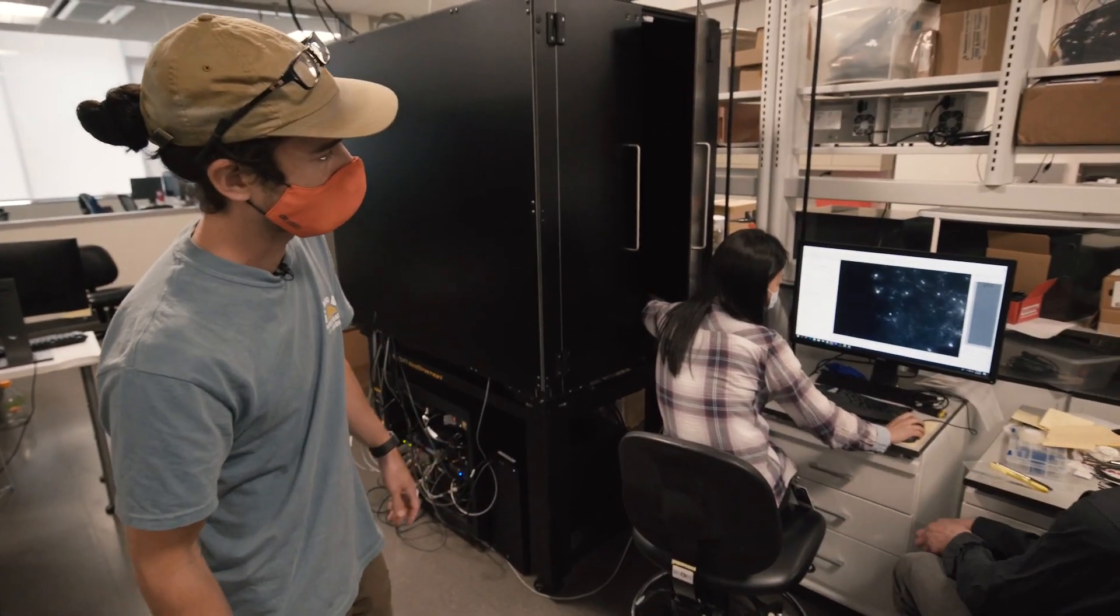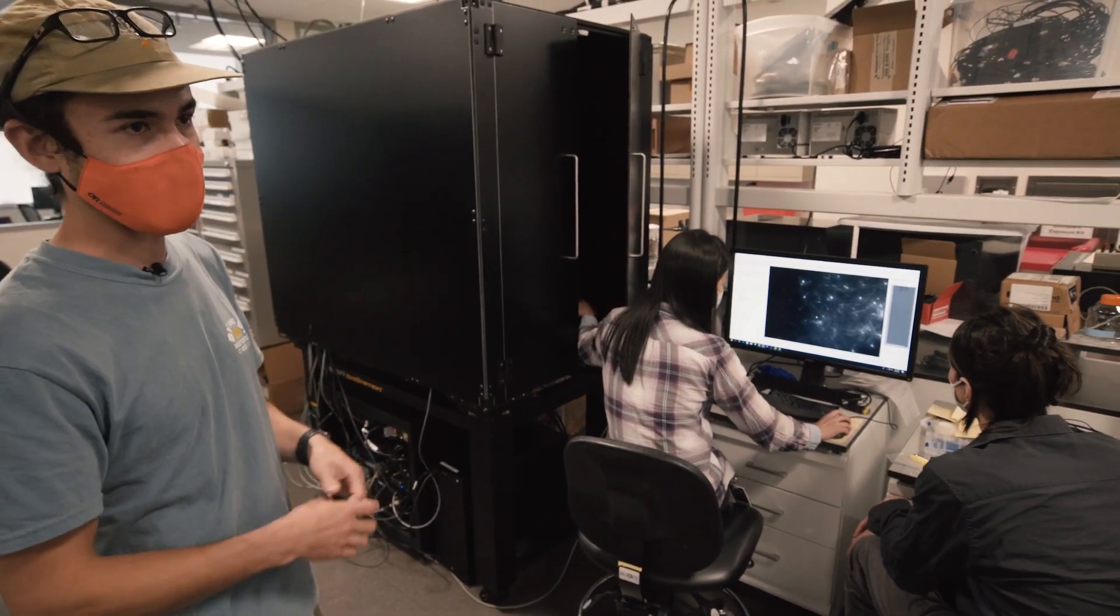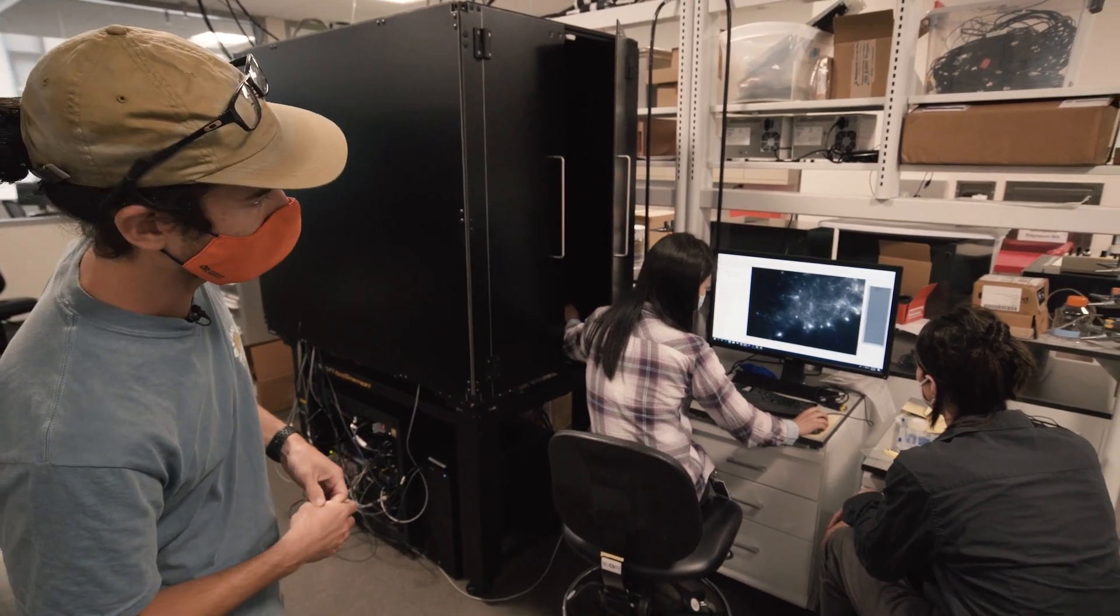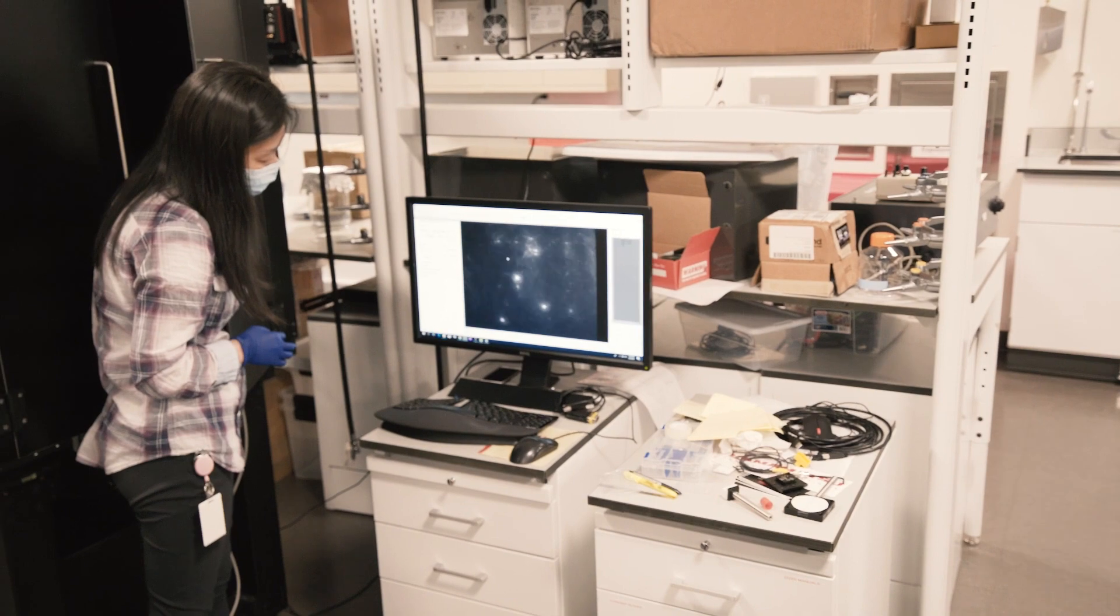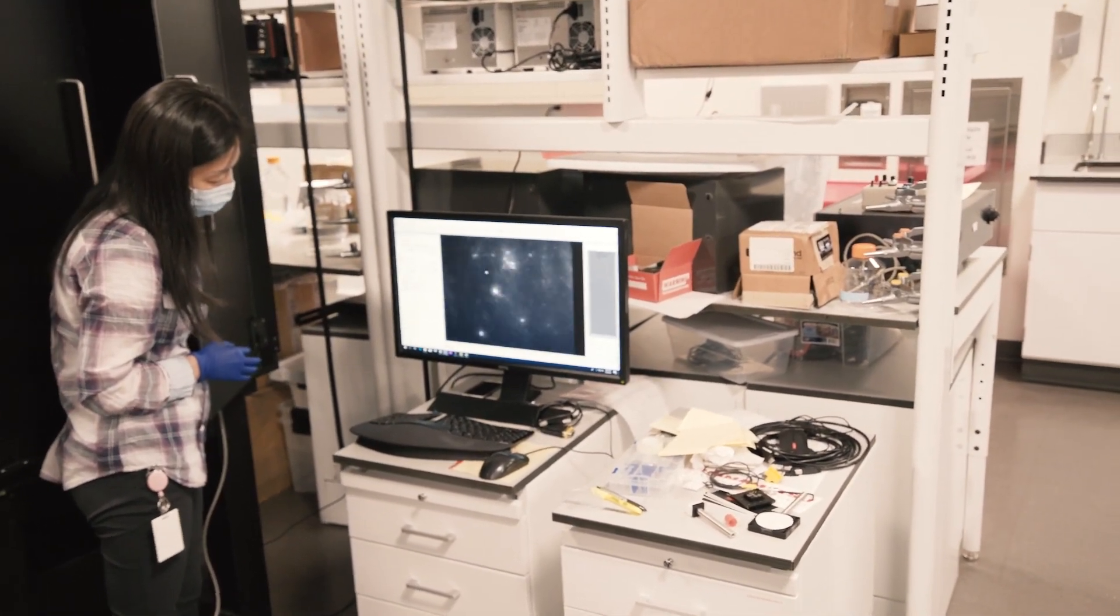All of the bright areas that are lit up, that's where the dye is and that's being hit by that light sheet. We're imaging the dye molecules which are essentially lighting up where the neurons are and where the neural connections are. That's really what we're after.